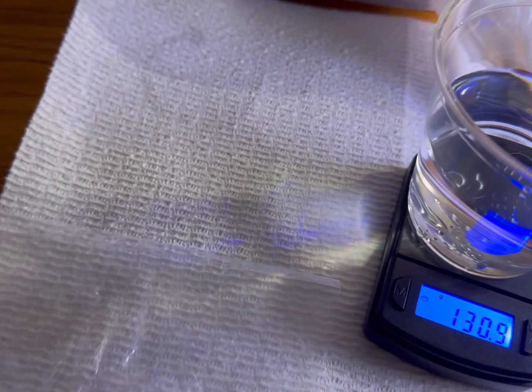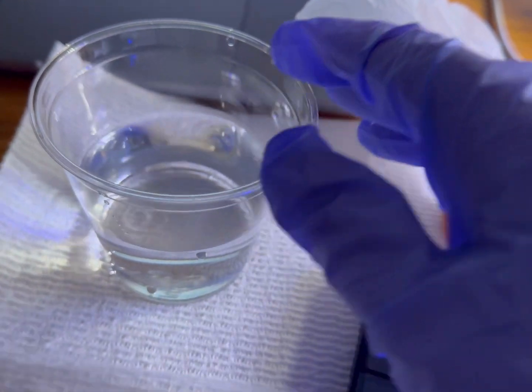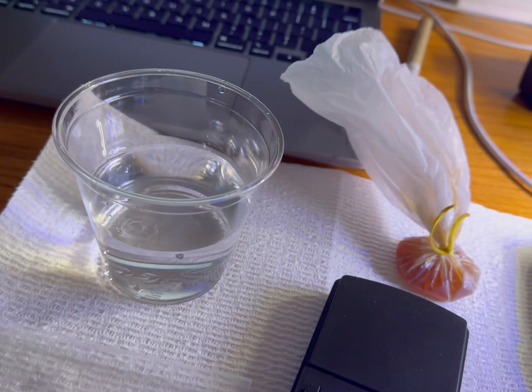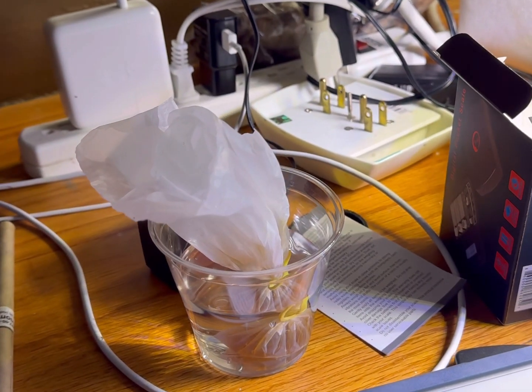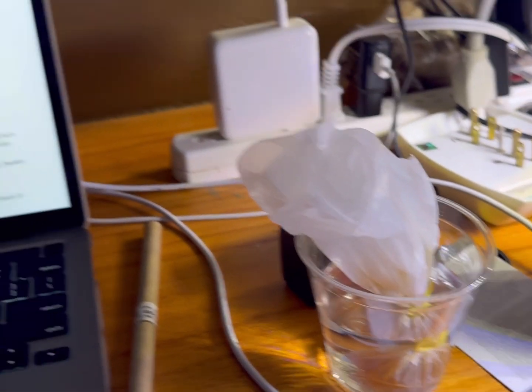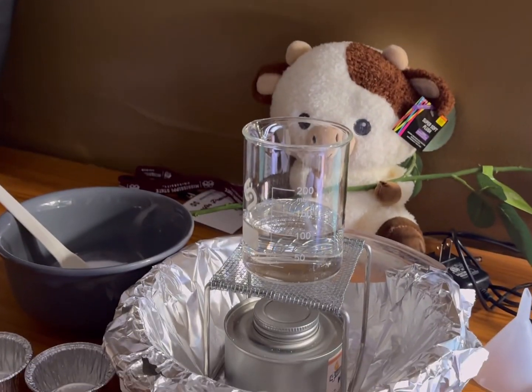And now we will let this corn syrup sit in this distilled water and see if any of their weights change for 30 minutes. So while we wait for exercise 1, the colligative properties of osmosis, we'll be doing exercise 3, the colligative properties of boiling point.